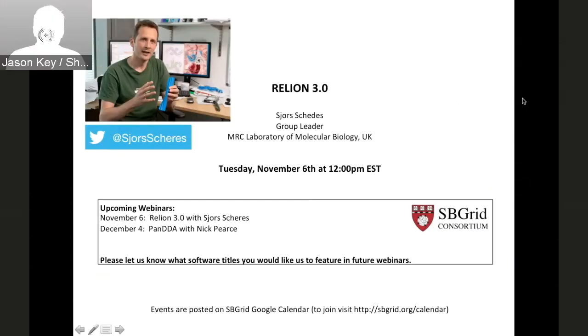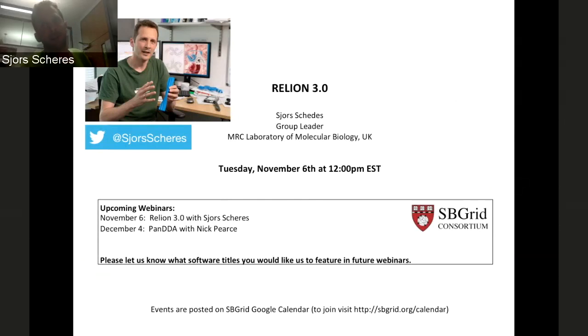That was great, thanks. There's just been a couple of questions in the chat, if I can pass those over to you. Yes? So we have one from Longfei, which is how to use multi-body refinement on proteins with high symmetry. That's a good question.